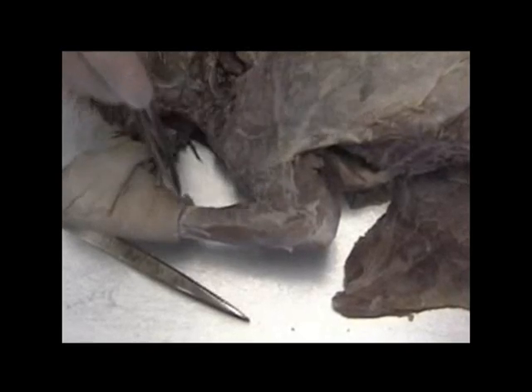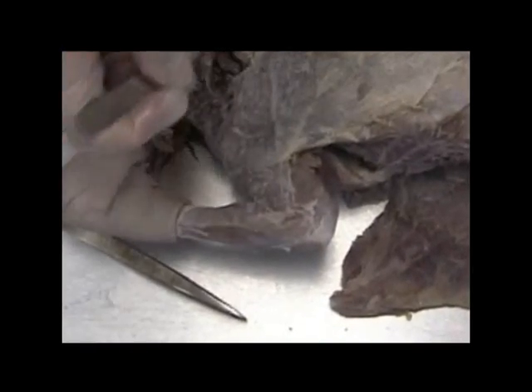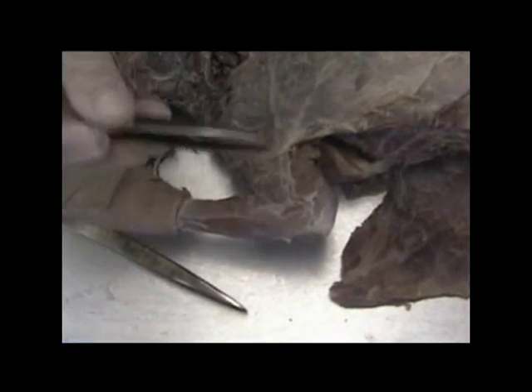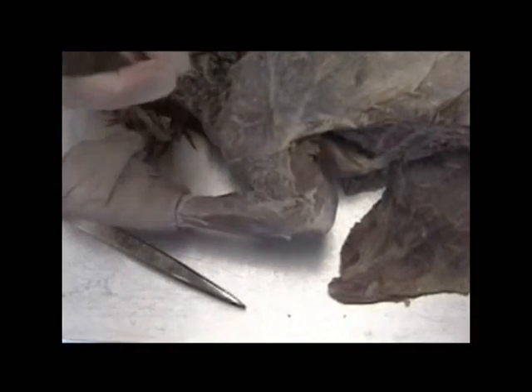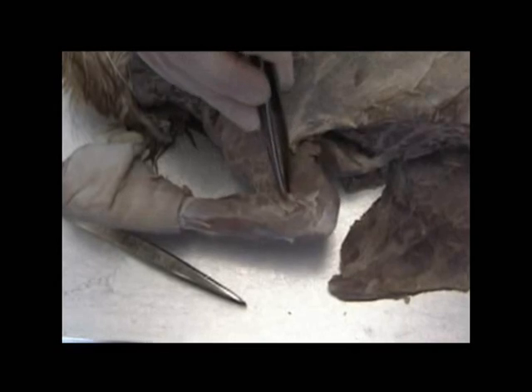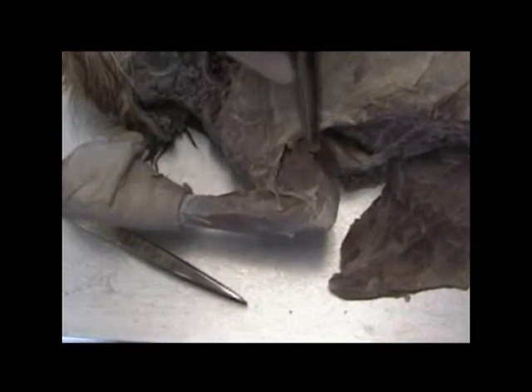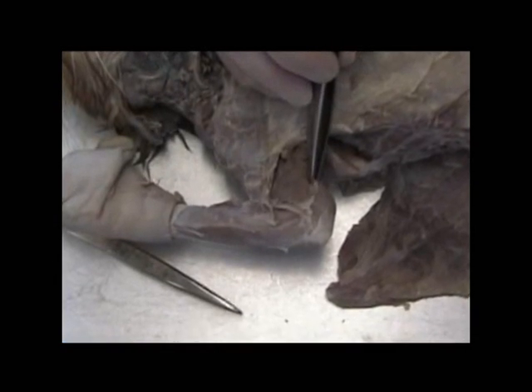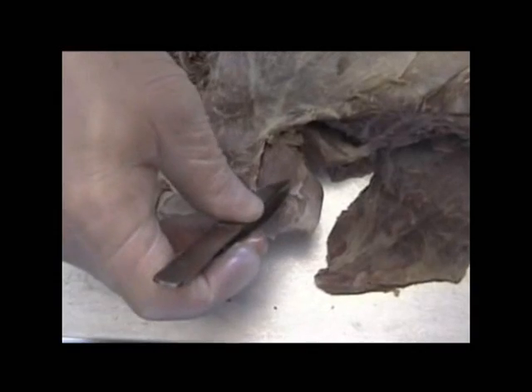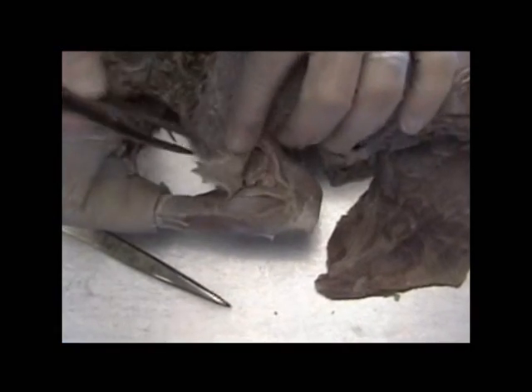Working with the foreleg now, the medial portion of the foreleg, we saw where all of these chest muscles came across, and many of them inserted on the humerus or somewhere up on this leg. We have some of those running all the way across here. But if we pick up on this muscle, such as the pectoralis major and the pectoantebrachialis, on the medial portion of the brachium, or the arm itself, we find the epitrochlearis.